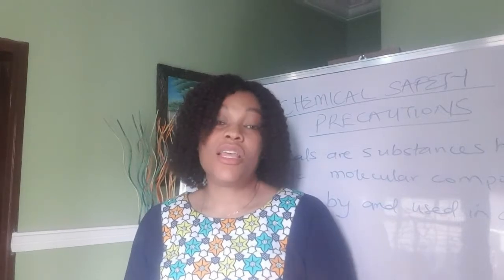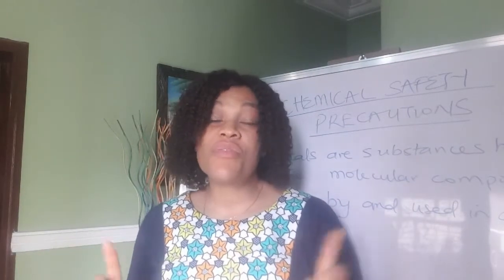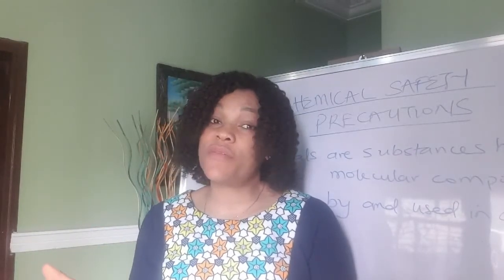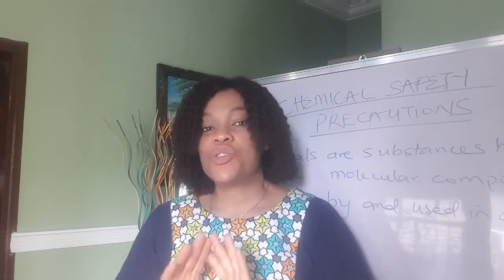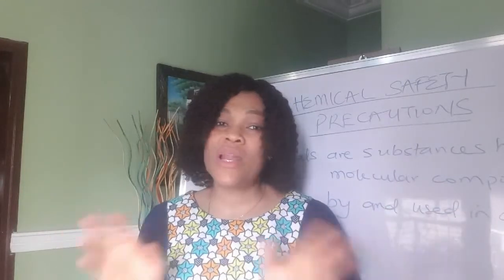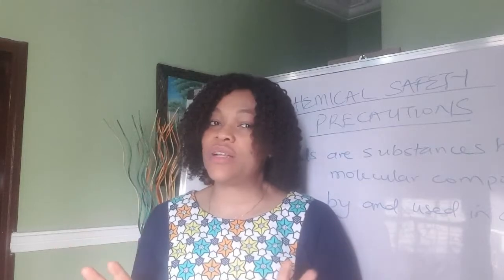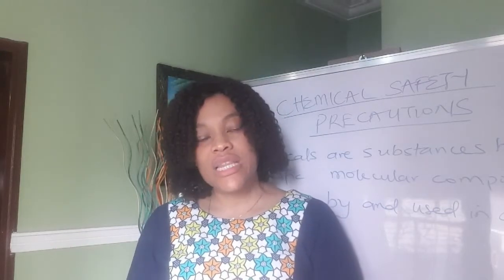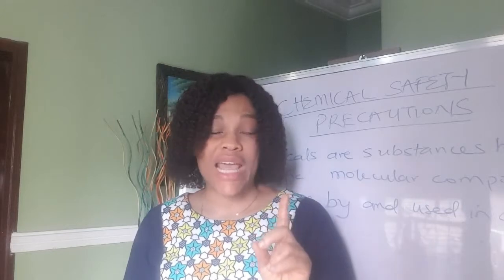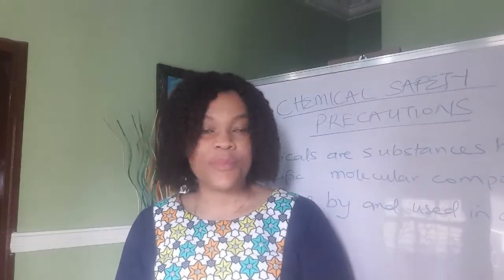Finally, if you leave the laboratory, ensure to switch off all electrical appliances, because these can cause fire. Make sure that you switch off everything, be it your microscope, your bulb, your fans, whatever is connected to electricity. Please switch off every electrical appliance before leaving the laboratory. And also make sure to wash your hands with soap and water before leaving.